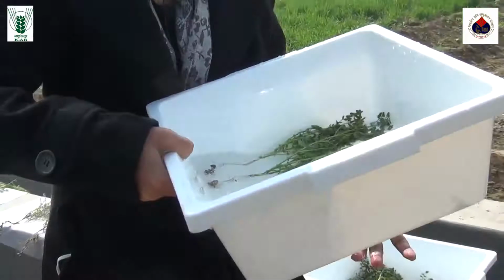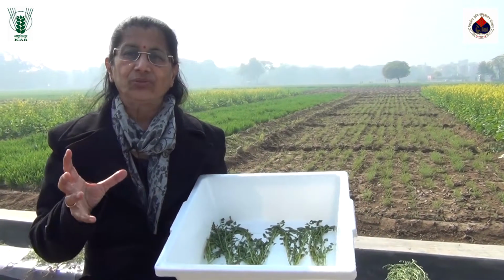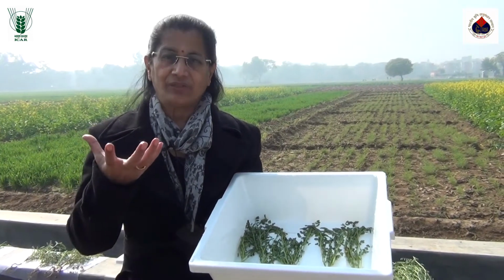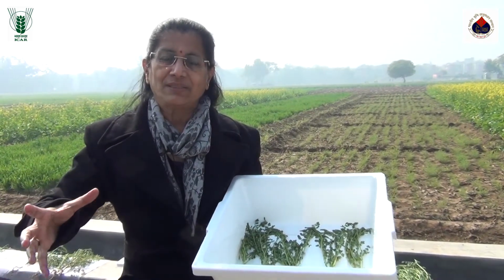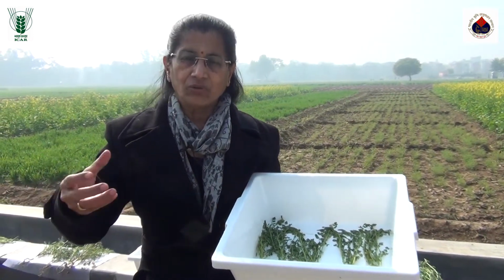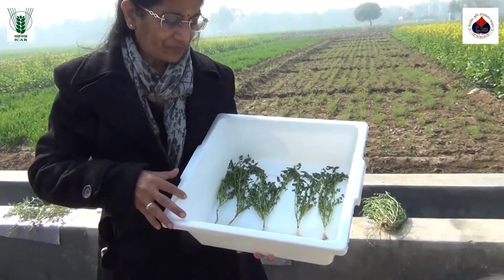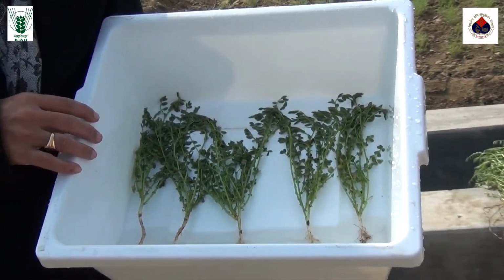Essentially, when you take out the plant with the soil, the soil should come out as intact as possible, and then you wash the plants and the rooting system in a bucket of water or under a very low flow of water, and after you wash it, you just place them here. So here I have 5 of these plants which are taken from the field directly.